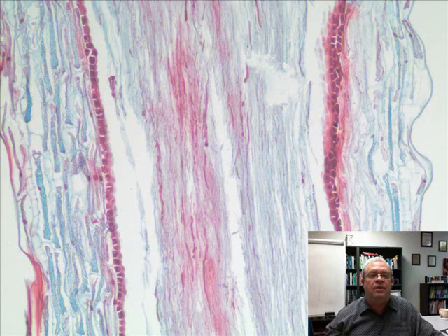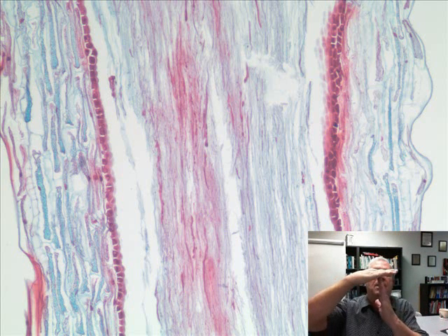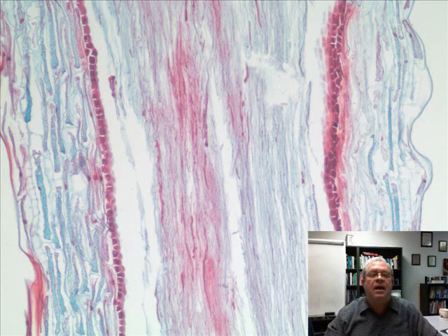And so here's our final picture. We're now definitely down the style. Here's one side, here's the other side of the style. What is this flow coming down the style? Lots and lots, hundreds and hundreds of pollen tubes. But we got to kind of hold them up. Okay, slow down, guys. We haven't gotten this ovule ready for your arrival yet. And so we're going to put this part on hold, and we're going to get Ms. Ovule ready here in just a little bit for the arrival of Mr. Pollen Tube. All right, that's it for this one.